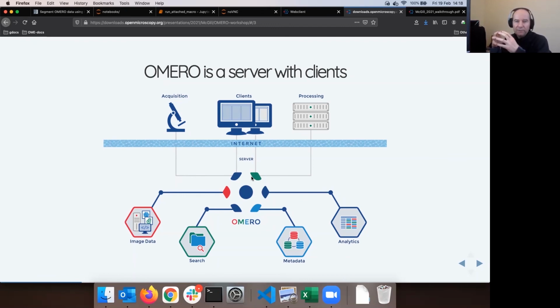They are not bad, of course, but are definitely untypical because they are there with the aim to showcase Omero. Is there a lot of storage space on that server? No, definitely not, because this is not what this server is there for. I hope this is clear, why we have the training server and what it is for.